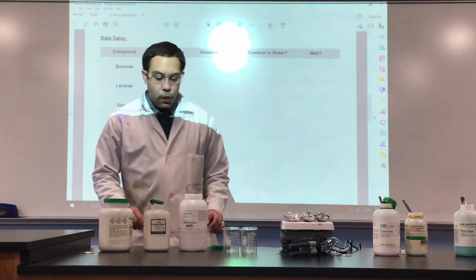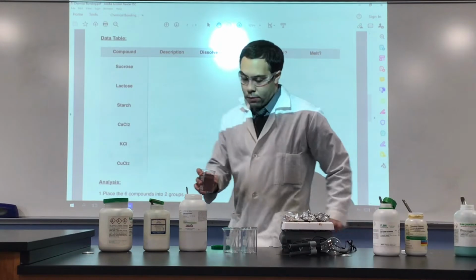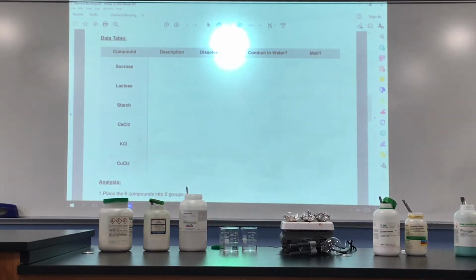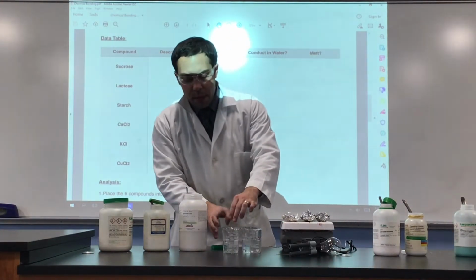So next we're going to see if they dissolve in water. So we will put a little water in each of the beakers. Okay, it's roughly about 50 milliliters of water in each.